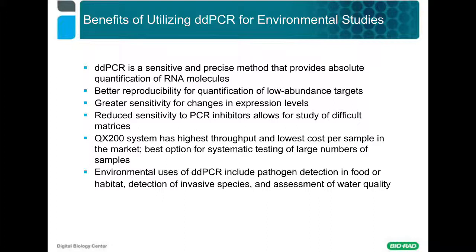Finally, it is the method of choice, or at least should be the method of choice, for several environmental uses of PCR, including pathogen detection in food or habitat, or detection of invasive species, or finally even assessment of water quality in either seawater or fresh water.